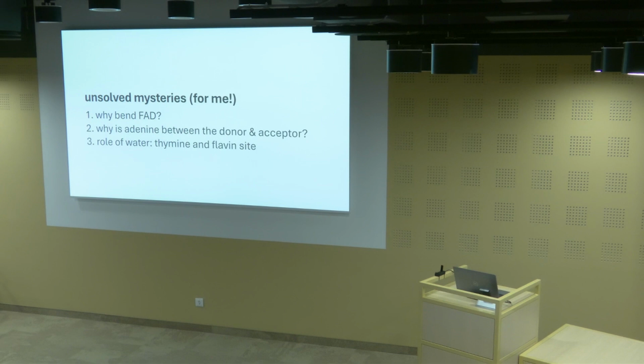And then another really interesting thing is the role of water. So we see water rearrangements on ultra-fast timescales that accompany this bending motion of the flavin upon excitation, and also in the active site pocket at all stages of the repair reaction that are difficult to understand and actually difficult to see in some cases in our structures.